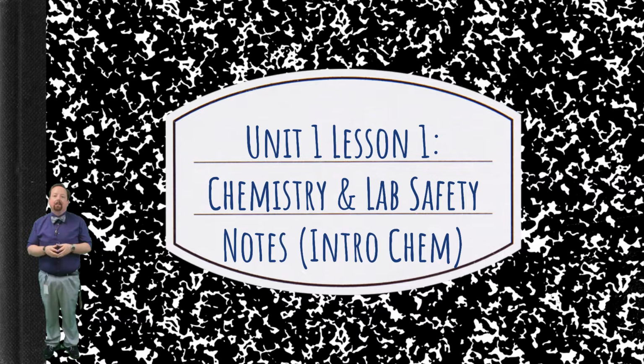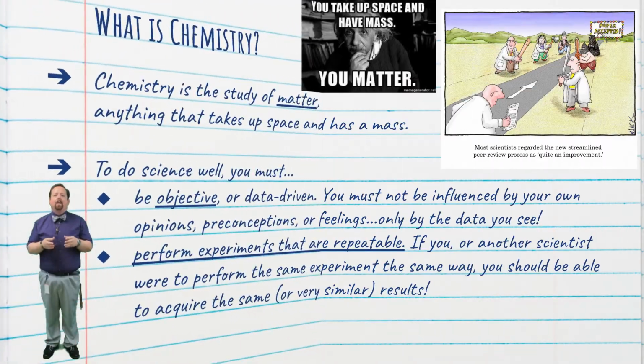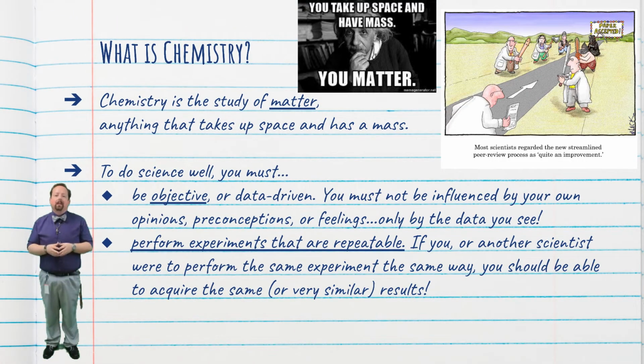of the slides. In today's lesson, we're going to learn about what chemistry is, what kind of equipment we use in chemistry, and some basic lab safety concepts. Let's get started. First off, what is chemistry? Chemistry is the study of matter.